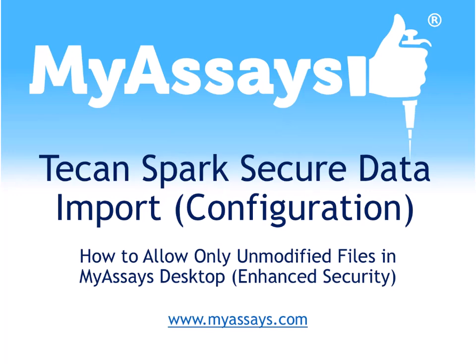I've already configured the automatic Spark workflow with MyAssays Desktop using folder poll. We cover that topic in more detail in the below video, but essentially as soon as our measurement data file is created and saved, folder poll will open the specified MyAssays Desktop protocol file, import the measurement data, and perform a set of specified tasks. In this case, I've selected for the data to be imported, results calculated, and an XLSX report exported.